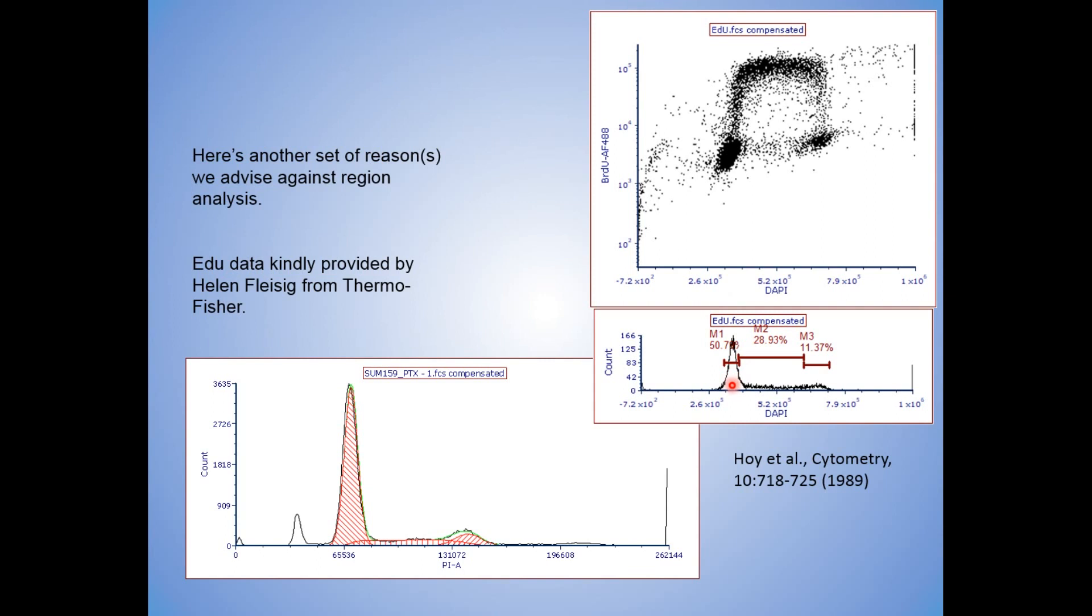But here's the region analysis. I have this here, S, G2M, G1, G0 here. I come all the way up. These guys right here are the G1, G0.